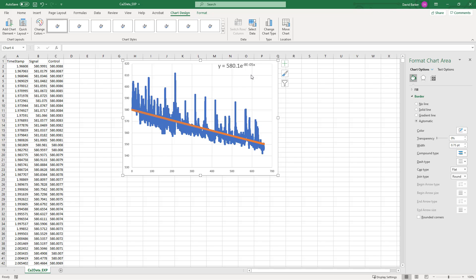However, this is not something that you have the option to easily do in Microsoft Excel. So again, while we work on getting some of these things integrated into the PMAT suite as background coding, this is a fix that will allow you to work with your data for now, because we're getting a lot of questions from people who have this exact same problem.